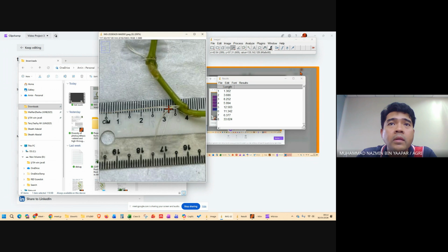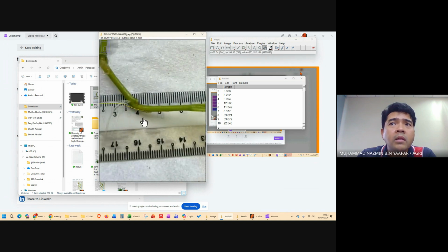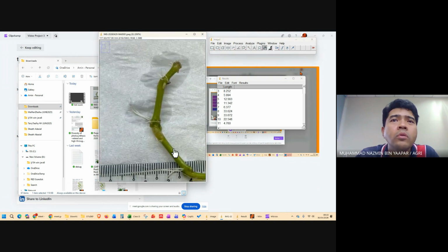Right. So let's select the next one. Ooh, this one's very long. 9. And I think this was somewhere that way. What else? I think this one. Let's say that's number one. Huh, what's the other one? I think I missed one. Where is it? I think it should be somewhere. Maybe that one. Yeah. Okay, this is clearly a demonstration. I waste too much time making this video, but you get the point.